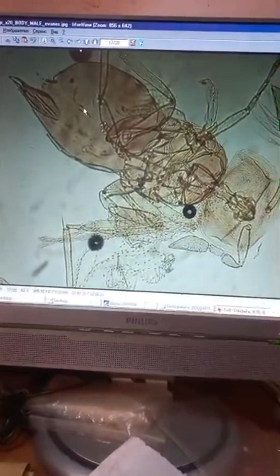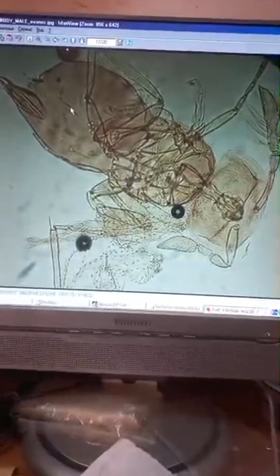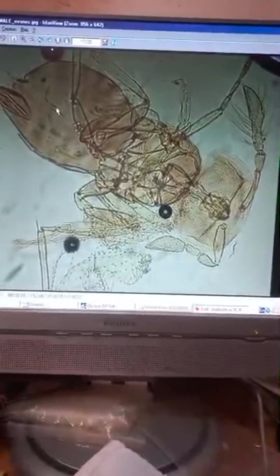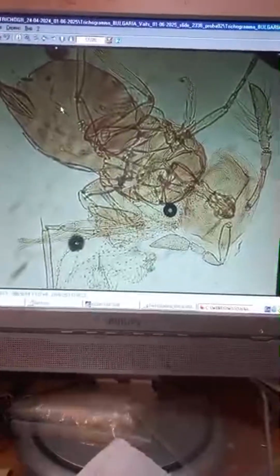You see, this antenna very short of female, short antenna of female, but body of male. Again, this is another picture of male's body with genitalia. But what about antenna? Antenna of two parts. One antenna belonging to female and one antenna belonging to male. So great combination. One antenna on the right side is fused and belonging like to male. Let's see on magnification. This is female's antenna. So big surprise.